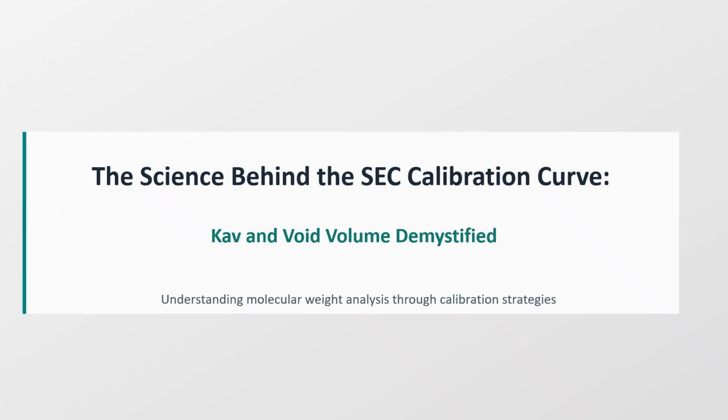But behind every molecular weight value lies a quiet hero, the SEC calibration curve, and at the heart of that curve sit two deceptively simple concepts, CAV and void volume. In this session, we're going to demystify these concepts, not just theoretically, but practically, so that the next time you look at an SEC chromatogram, you'll understand why molecules elute where they do, what CAV is truly telling you, and how small calibration mistakes can create big analytical problems.